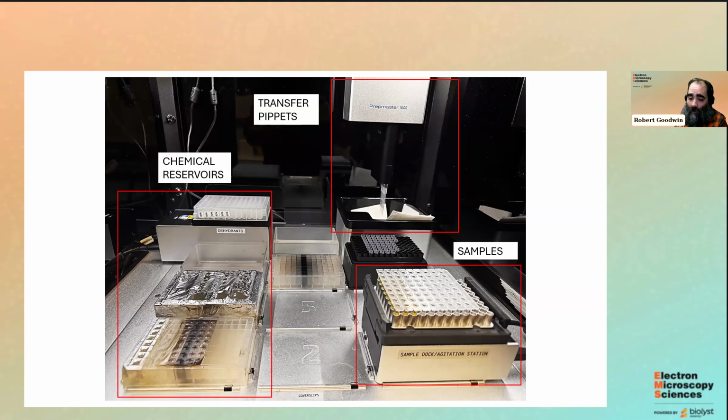I pop the plate in there with the cover slips, and then I have it dispense more liquid, because they tend to be a little bit hydrophobic when you're dispensing, and I have to have more liquid in it. As I edit the protocol, I make those adjustments. Since it's not agitating, I also have the times increased a little bit.